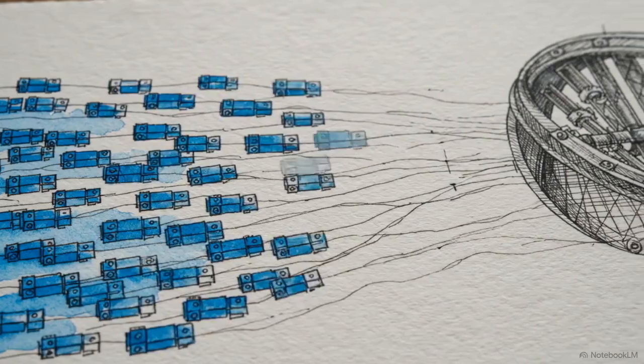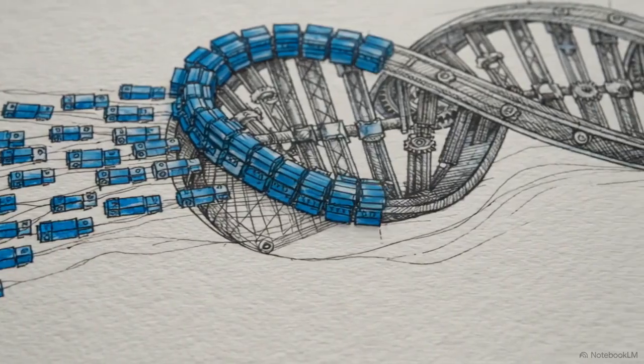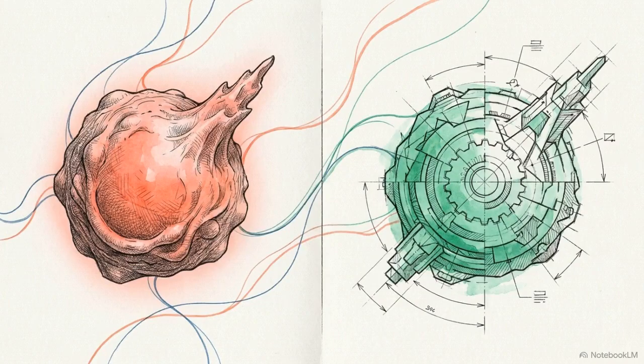In clinical oncology, identifying a single pathogenic mutation requires searching through hundreds of millions of DNA base pairs. The immediate challenge for a bioinformatician is distinguishing a genuine biological anomaly driving a tumor from a random optical error made by the sequencing machine.